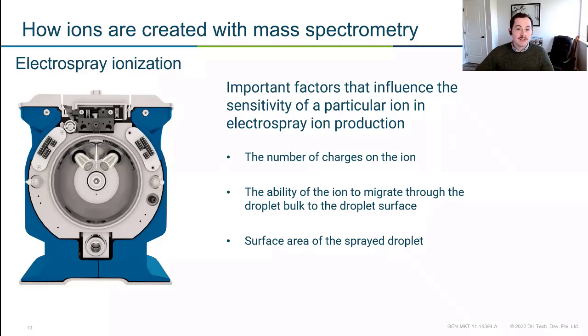Some of the things we'll consider during the method development stage are what ionization type to use. Right now, all my examples will be in positive mode because it doesn't really make a difference in terms of theory. But in the method development section, you might decide, hey, negative ionization is really how I'm going to get this compound to move through my mass spec.